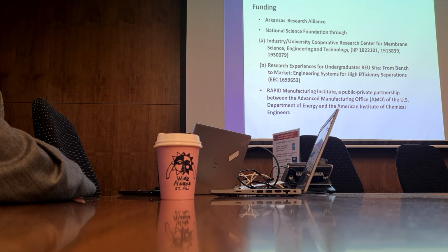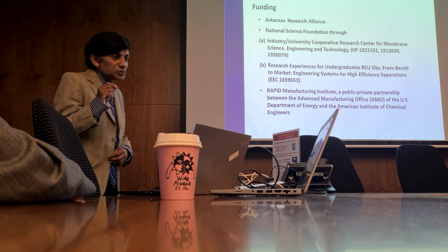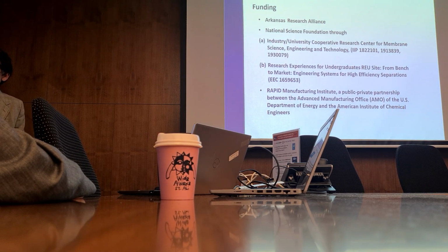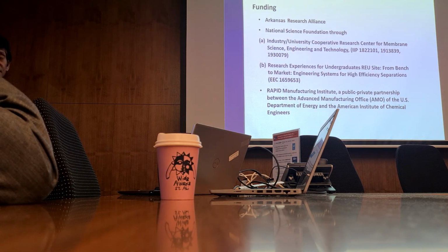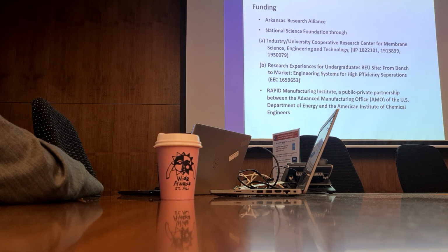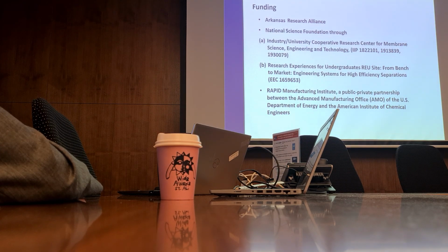Yeah, but one point was that we were not supposed to do any membrane development. I didn't talk about that here. So it was supposed to be all commercially available membranes. My colleague who did this used a commercially available PVDF. Any wetting issue, because you use the MDC and MD? MDC is only my work, an additional part.